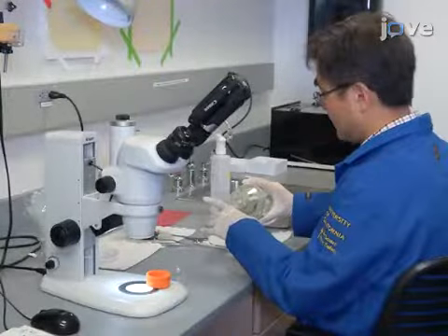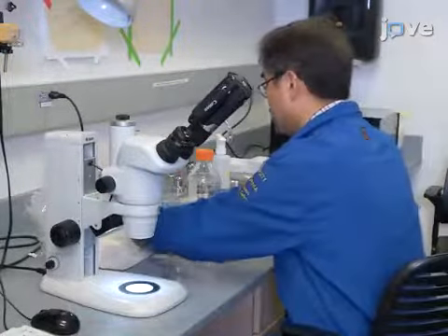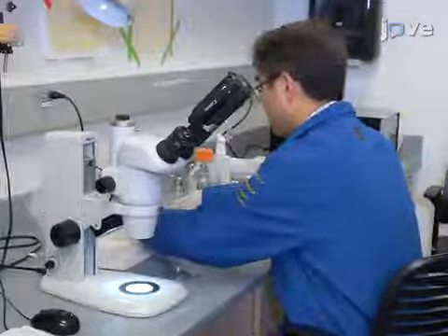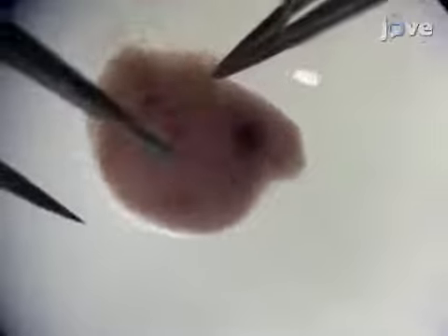Begin by separating the head from the body of the embryo under a dissecting microscope in a petri dish containing fresh, room temperature PBS. Grasp the head with one pair of fine number 5 forceps, and use a second pair of forceps to remove the upper brain, cutting away any extra tissue outside of the palatal shelves with the second pair of forceps.